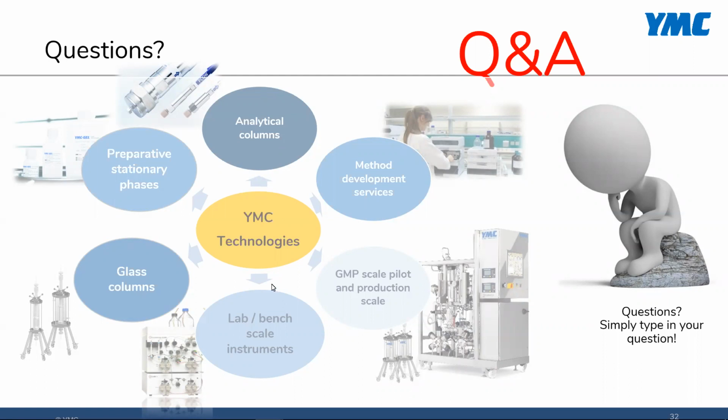Okay, thank you. It looks like there's a lot of interest in columns. Jeff, this one I believe you would be appropriate to answer. In reference to the DAC columns, why is the DAD model easier for unpacking than the DAU?